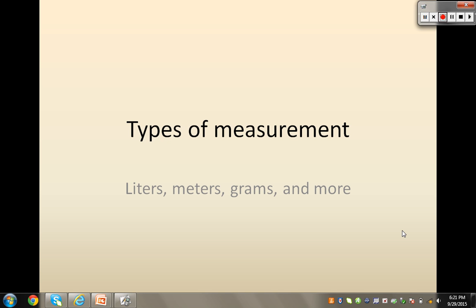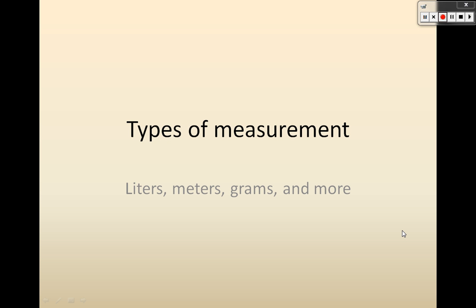These are notes on types of measurement. So here's where you're going to learn about like liters and meters and grams and even other things. I'm going to teach you the tools you use and the units that are used and maybe different options for the same measurement, so that then when I say something like go get the beaker and put in 20 milliliters of oil, you know exactly what I'm talking about and how to do that.